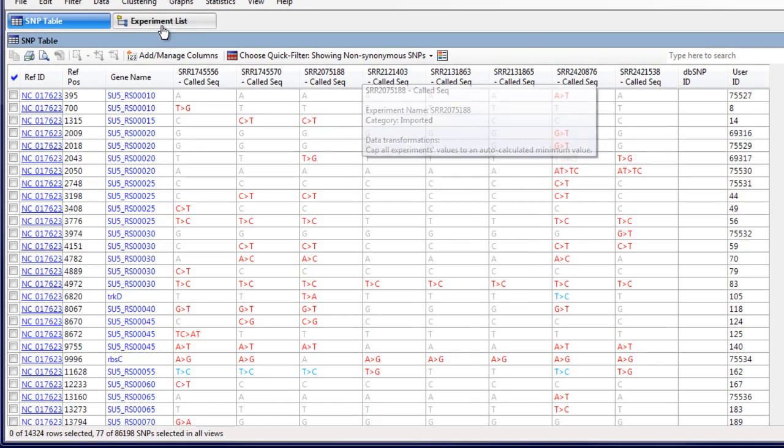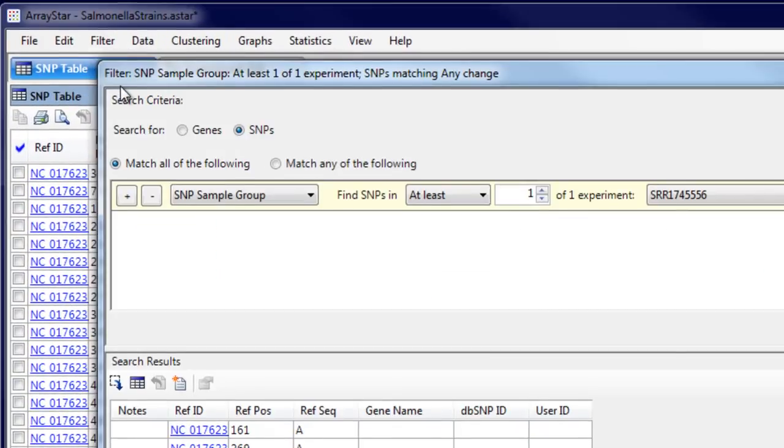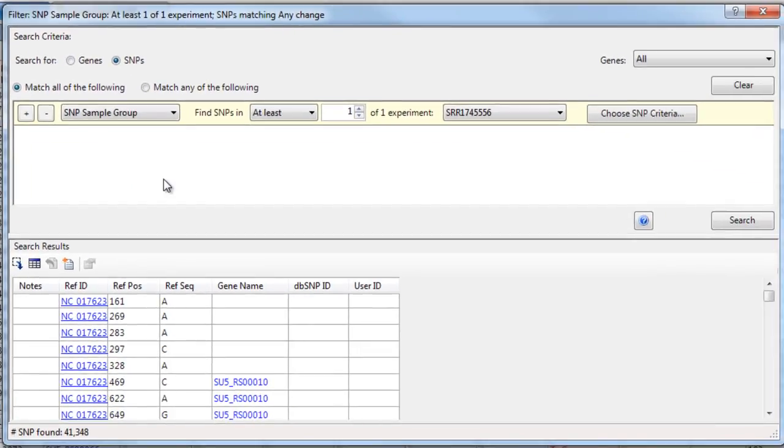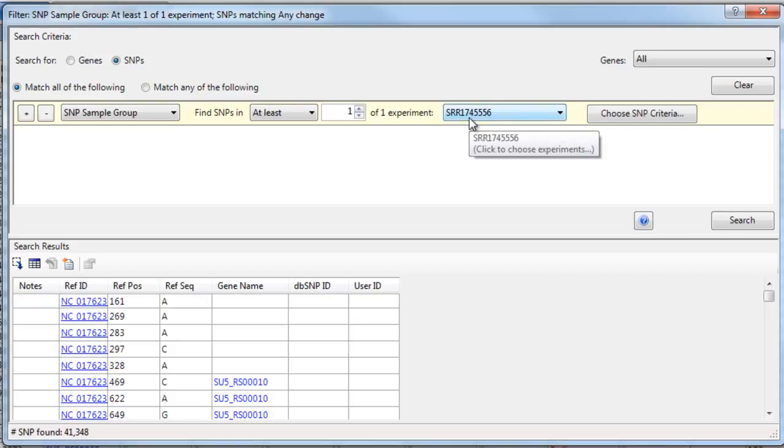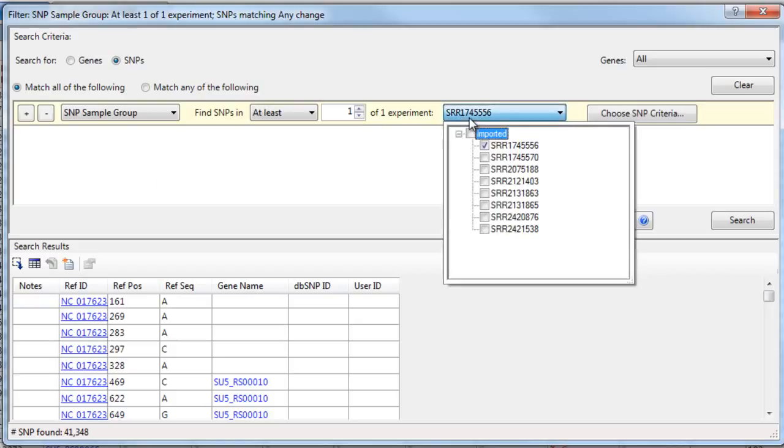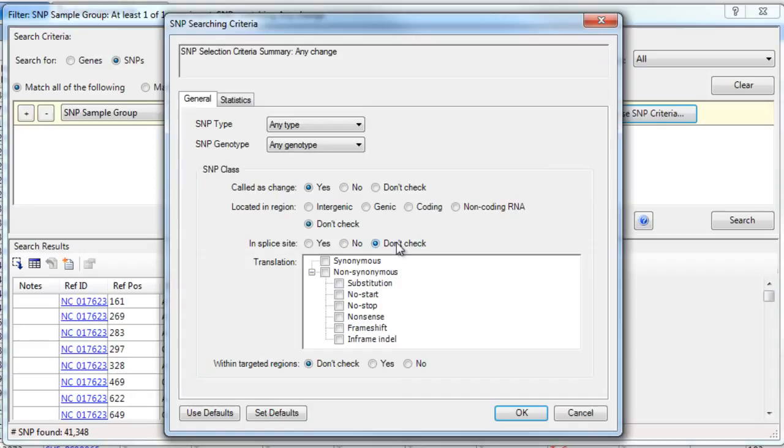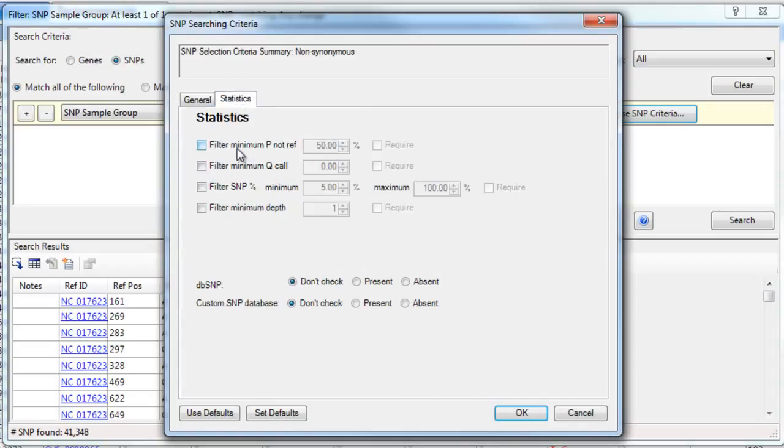Or, select Filter, Filter All, to do more advanced filtering on the gene or SNP level. For example, let's look for SNPs in one of the experiments that are non-synonymous and have a p-not-ref of at least 90 and a depth of at least 10.